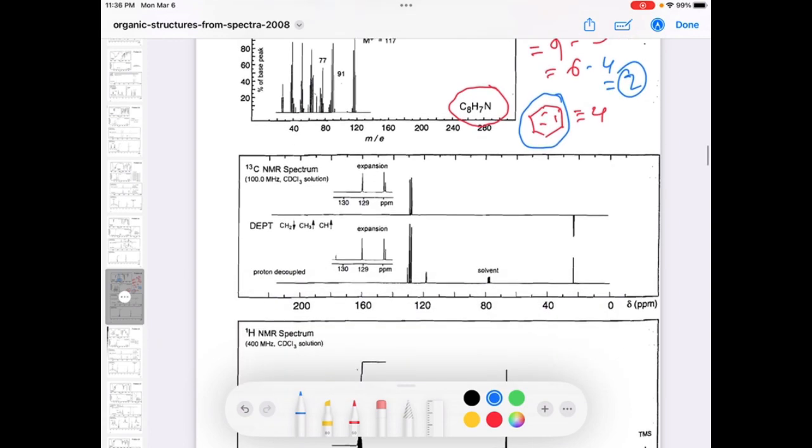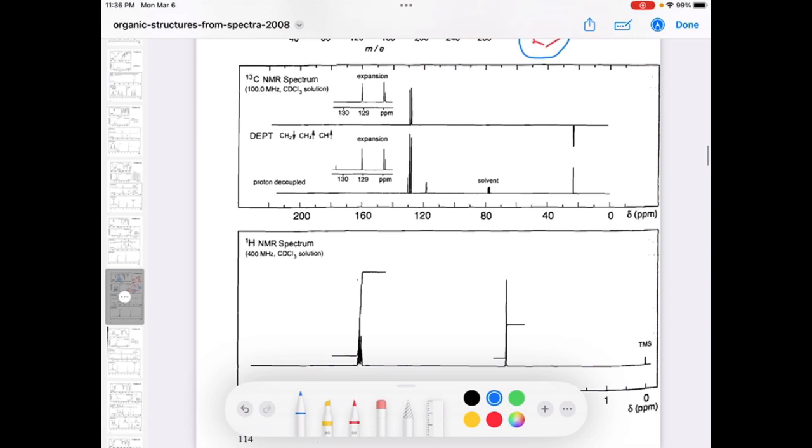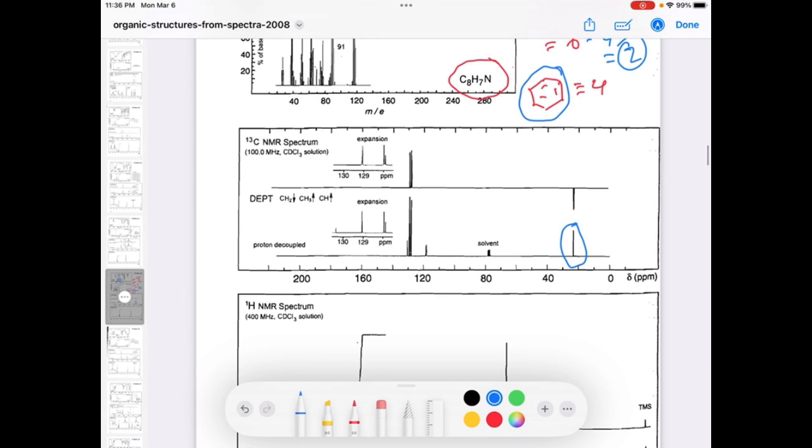Let's see if we can get more idea from the proton NMR and the carbon NMR. In the carbon NMR, there is an aliphatic carbon around 30 or 25 or something like this. So that is aliphatic. That carbon could be CH3 or CH2, but how many protons are in this carbon?